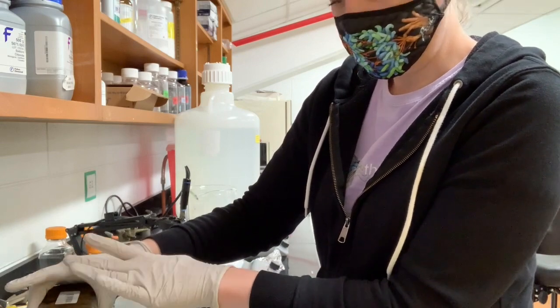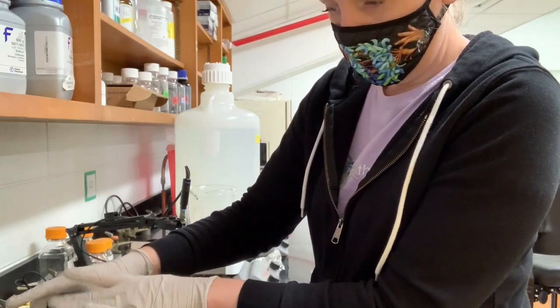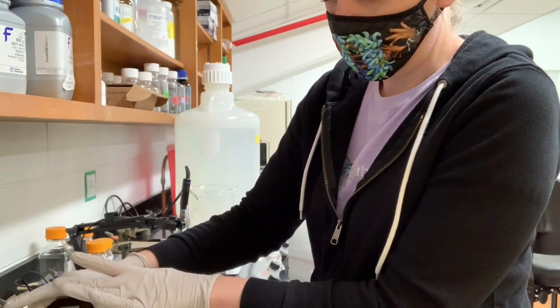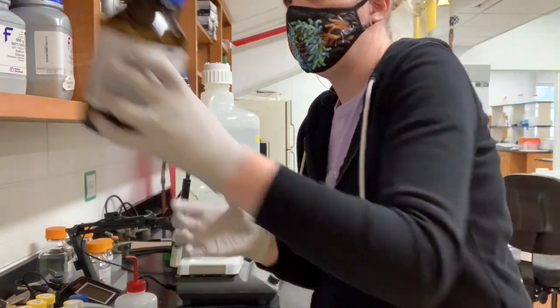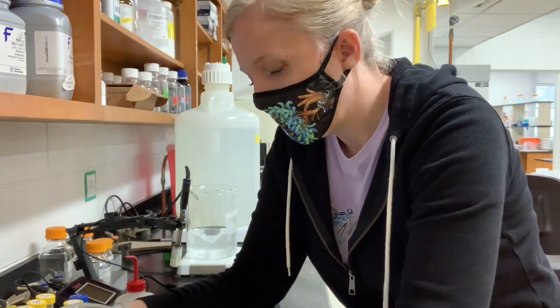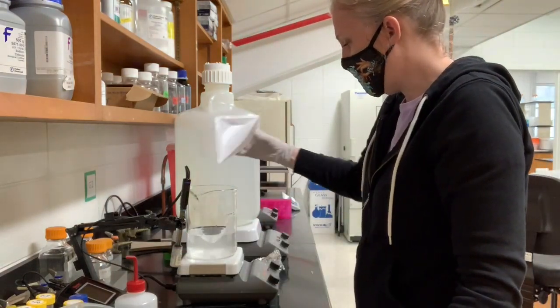So when I get close, I'm just kind of tapping the bottle so I only get the amount that I want, or it comes out a little more slowly. Some of these will have a big chunk of salt in them, so you can always just shake them up if you need to break that up, or you can break them up with a spatula too. So I have that amount of my potassium phosphate.